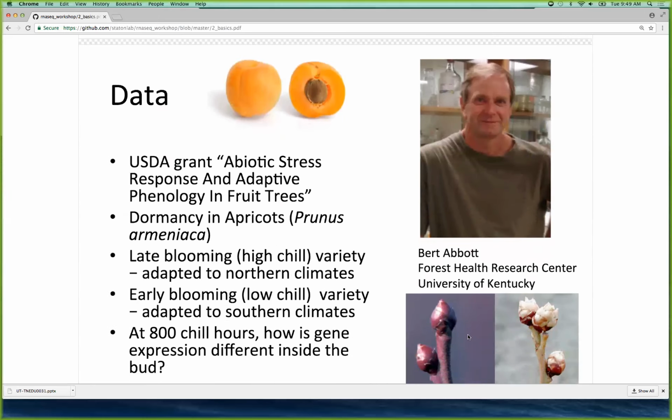No, that's something you do downstream. You save your RNA and quantify it later on. In my argument, and I have gotten away with this for the past 3 years, if you have enough biological reps, you've done due diligence. You've quantified the variability in your sample. And I think most reviewers are starting to buy that pretty well. So the PCR is more for when you have one sample, one treatment and one control, and that's statistically going to be problematic. Please go do your RT-PCR and preferably add some biological replicates.